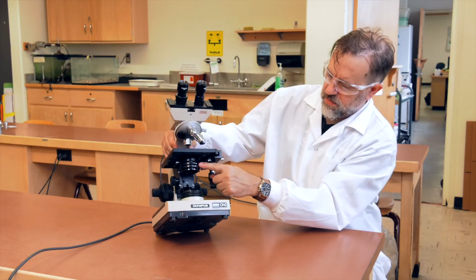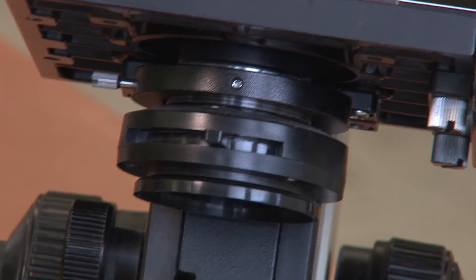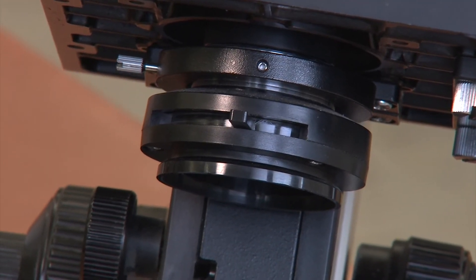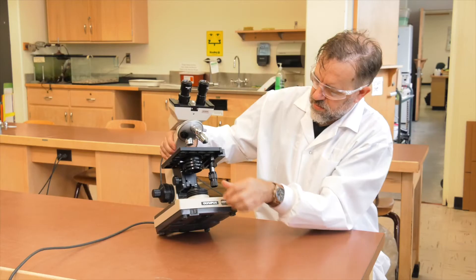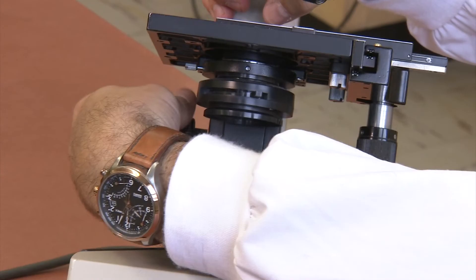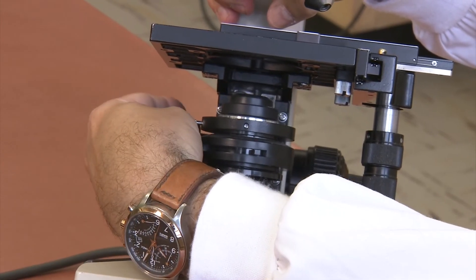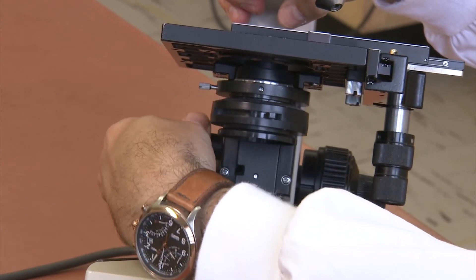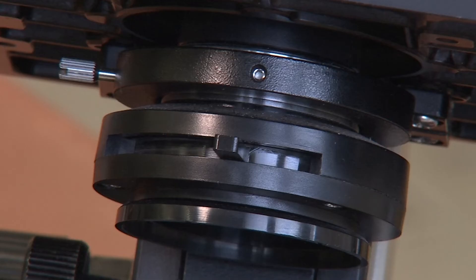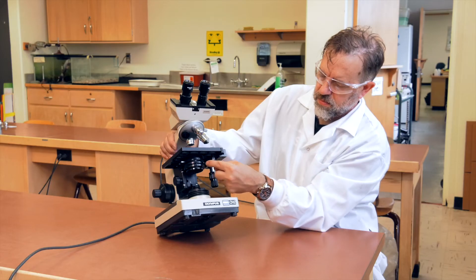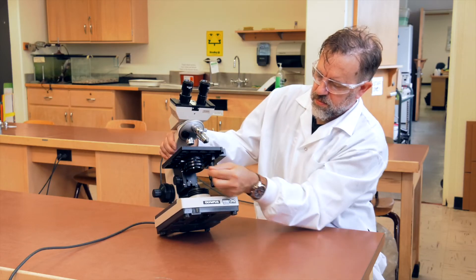Directly below the stage are the condenser and iris diaphragm assembly. The condenser focuses the light directly onto your sample and is controlled by the condenser adjustment knob, located on the left of the stage and assembly. The iris diaphragm adjusts the amount of light that passes through your specimen and is used to increase the depth of field, which means that a thicker plane of your sample will be in focus.